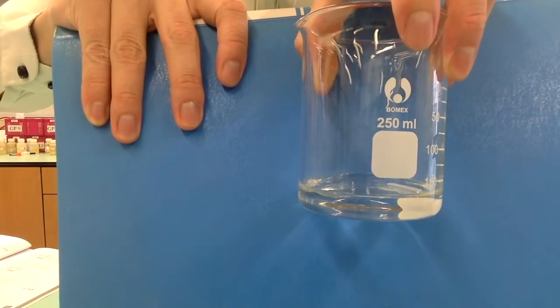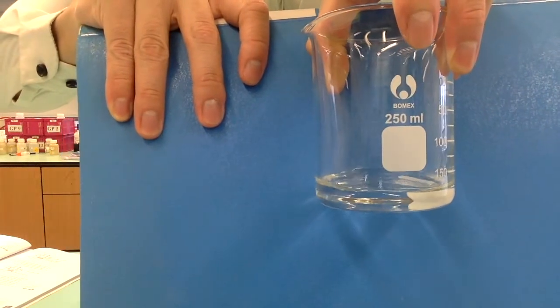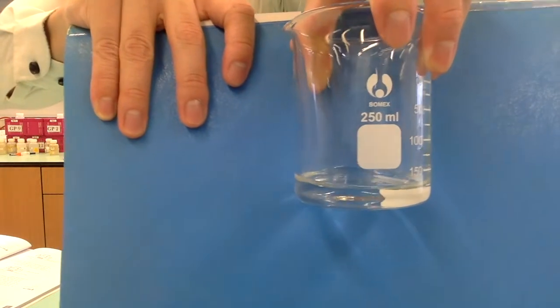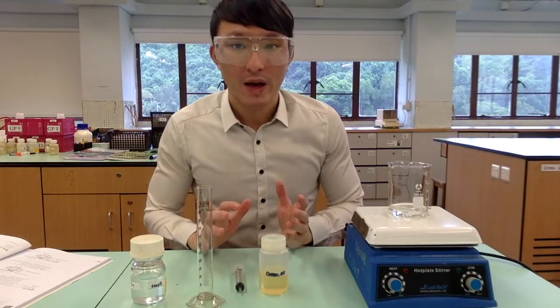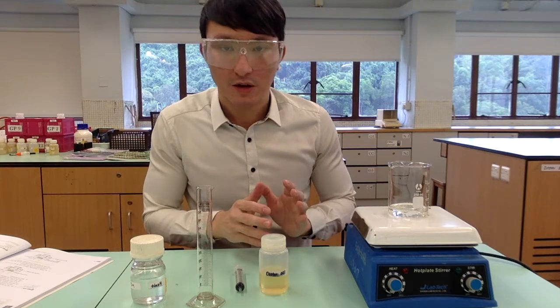After adding the oil and sodium hydroxide into the beaker, you should be able to see two immiscible layers of liquid. The upper layer is obviously the oil and the lower layer is obviously the sodium hydroxide. Now, we are going to switch on the stirrer as well as the heating stove.